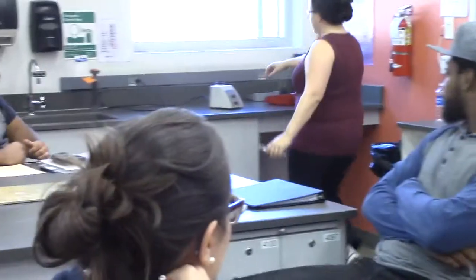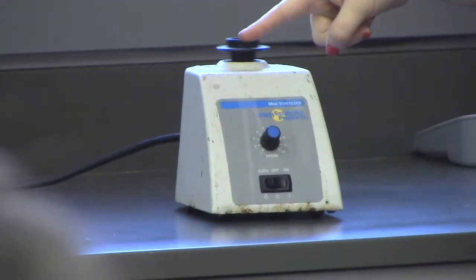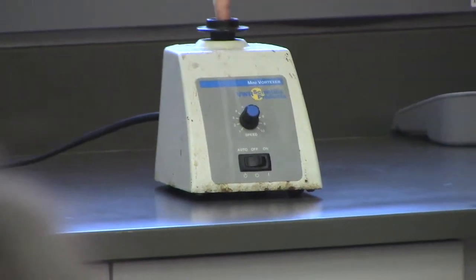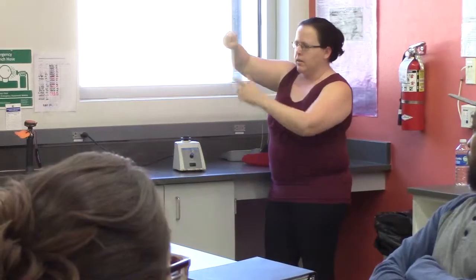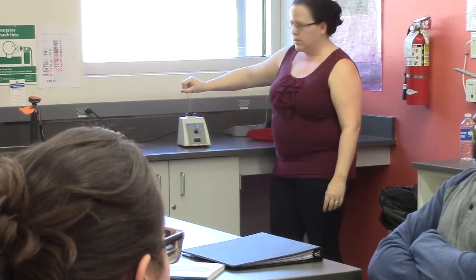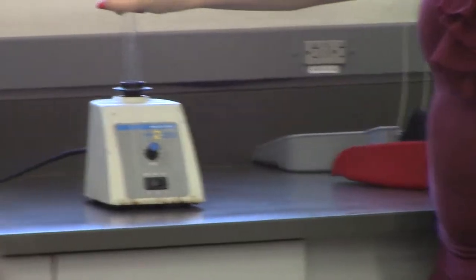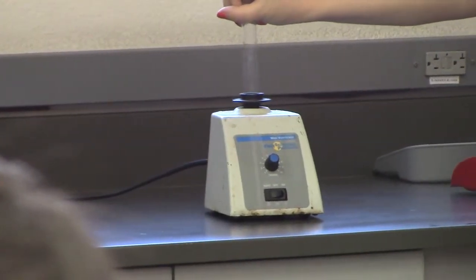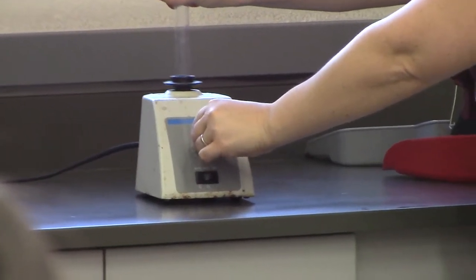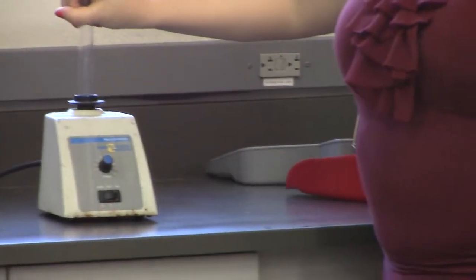These are the vortex mixers. Make sure they're on, and the little top spins around. If you put them on auto, it won't spin around until you press on it, and it spins around. You want to hold your test tube by the top over the opening. Take the round part of the test tube right in the center and press down. It's going to vibrate your sample in little swirling motions, and it'll stir it up for you. The dial here changes how fast it spins. If it goes too fast, they're a little hard to hold on to, so you don't want to go too fast.